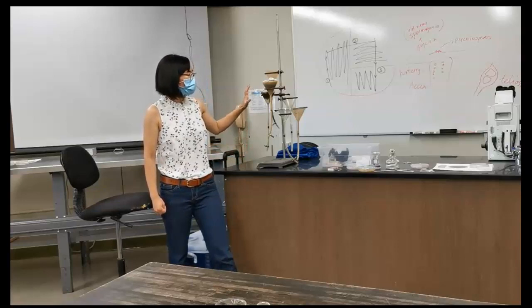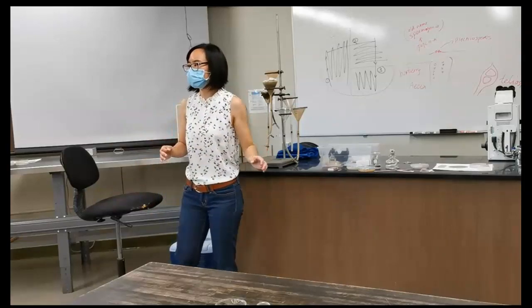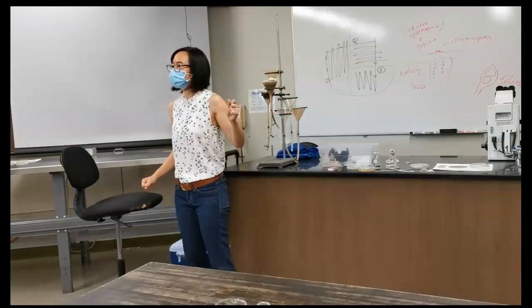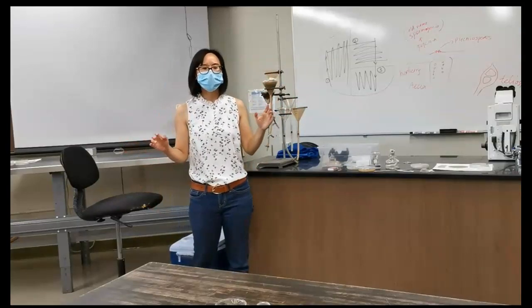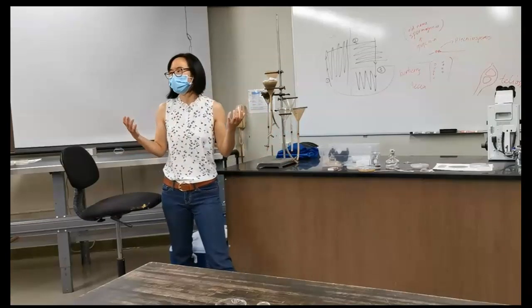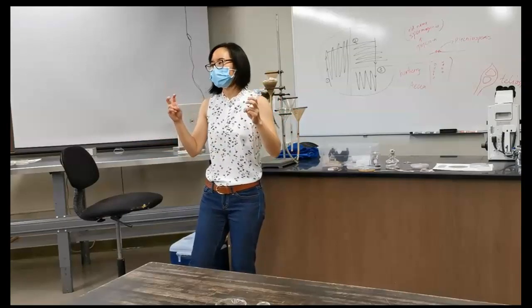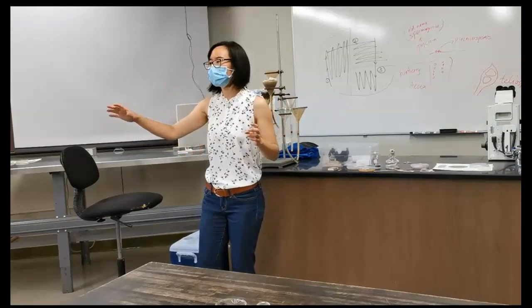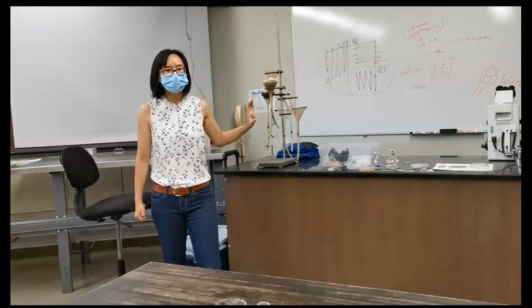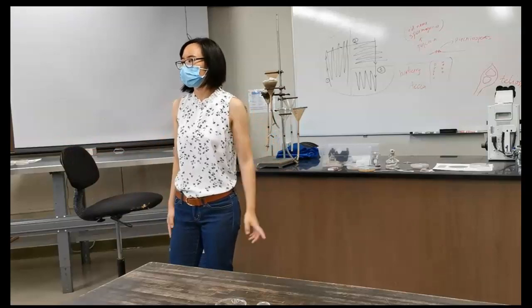We have the device set up, and because we have to share with another section, the section from 10 o'clock have already sampled several drops of water. So I am afraid that we don't see nematodes if we sample more because it's going to be diluted. So I just asked them to keep their nematode solution, and you can see that they're on your dissecting scope. So you can try to get more sample, but if you can't find a nematode, then you can always look at the dishes that are already on your dissecting scope.